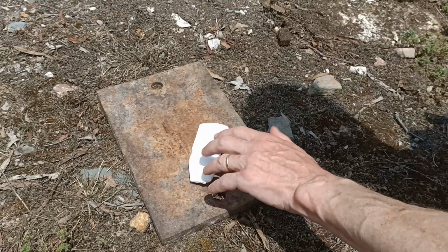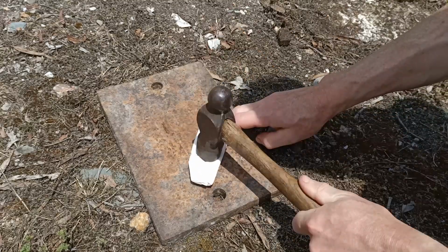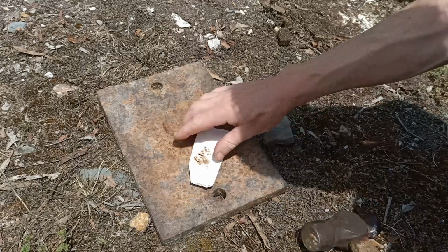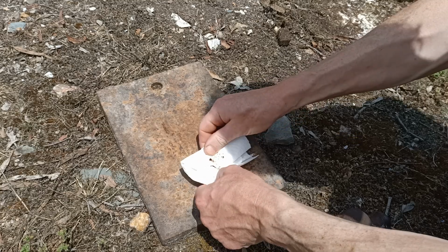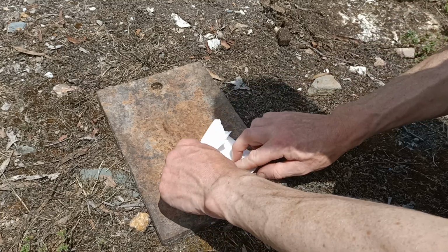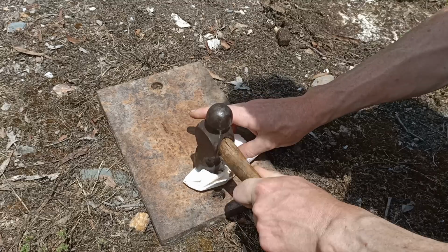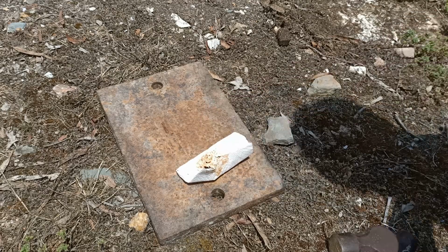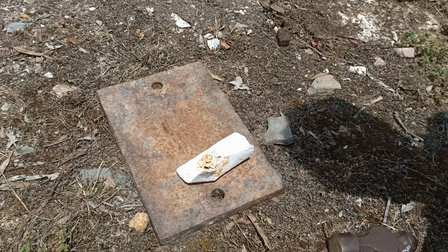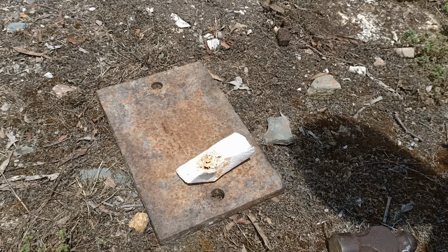Doesn't have to be too fancy. Give it a bash with a decent hammer. And fold that, which is never quite as easy after it's going to leak out, but you've got plenty of powder in there and a couple of lumps. I usually tip that out into a clean container and then take my sample out of that. A quick and easy way of preparing samples, minimal contamination. That paper's a bit thin, but newspaper doesn't split up quite as easily.